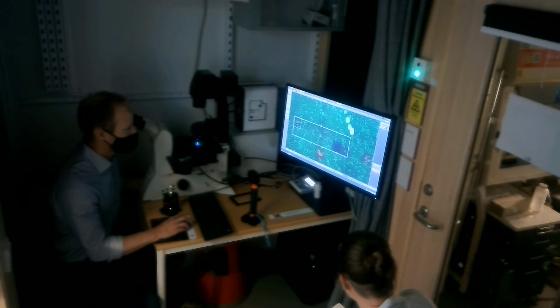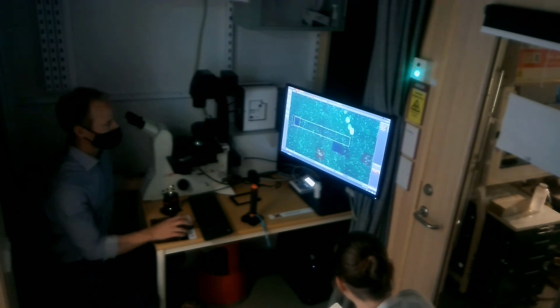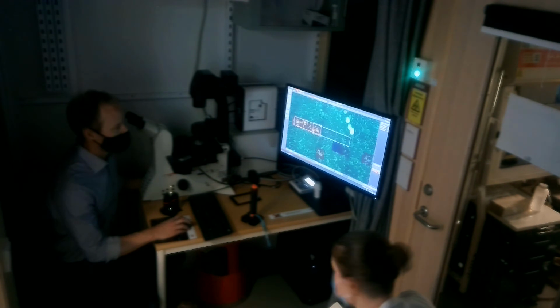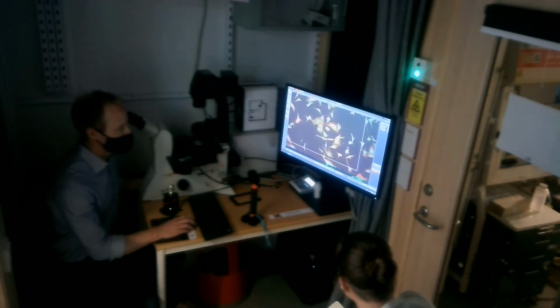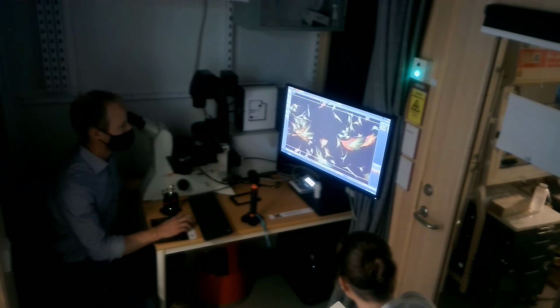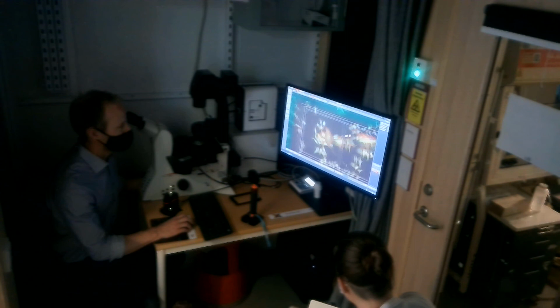So if I run this one now, let's do this actually. Just for simplicity, I will just resize so we just have one. So if I run this, now we'll do all these three, and we already know that it will not be in focus here, but it should be in focus over here. Sign that my cover slip or the slide might be tilted. But here, okay, it's not perfectly focused, but it looks pretty okay. And then over here, it's not in focus.